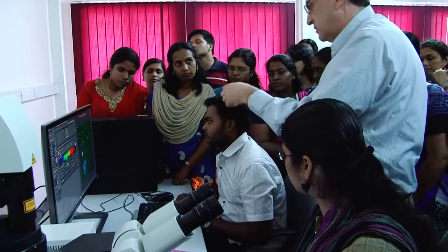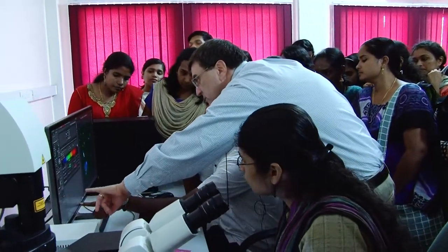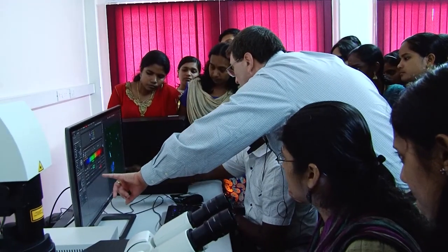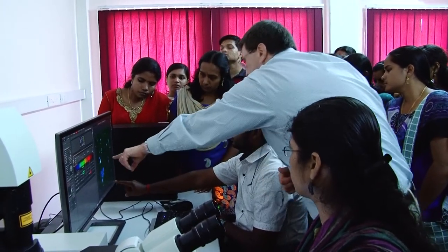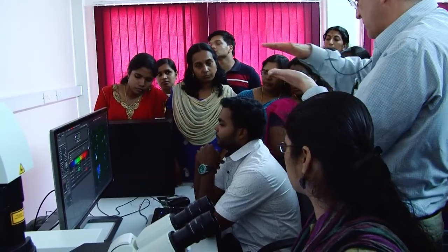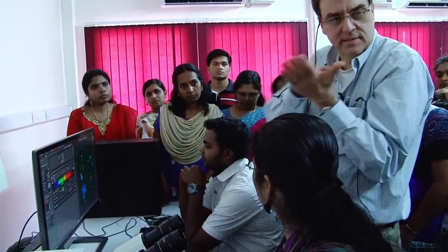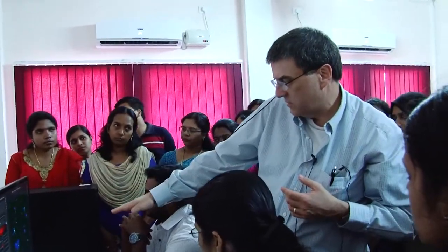Okay, so what it's doing, it's taking its way, and where does it show Z? Does it show where the Z reads out? We have 27 steps, so we have reached 9. Oh, okay, so it's going down. Yeah. So see, here's Z, and as you can see, the focus is changing. Because remember, the whole idea of confocal is to take that thin optical plane, right? You take that thin optical plane. So what we're watching here is we're watching it work its way through the diatom.